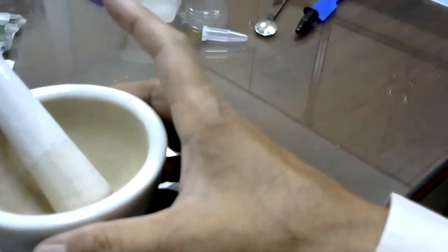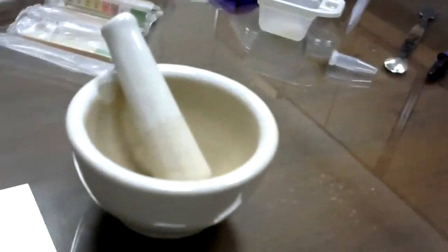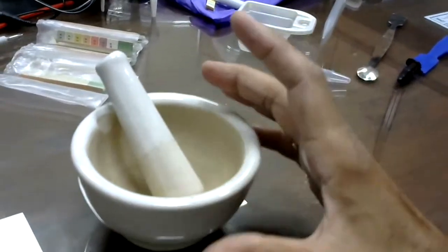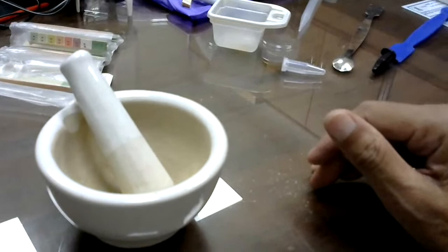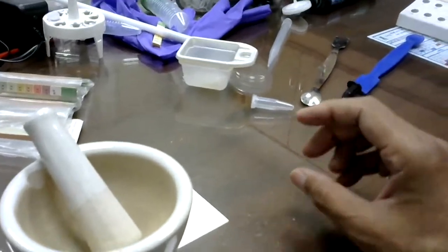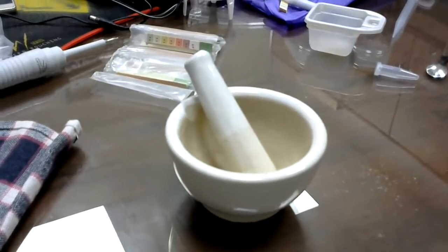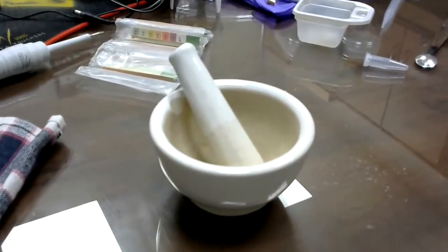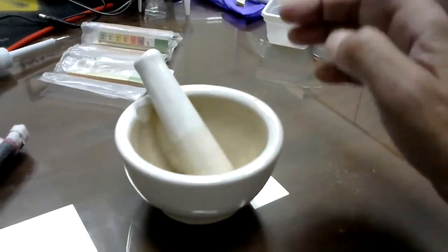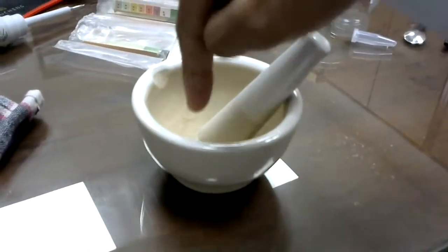Then sometimes we use liquid nitrogen for grinding. If you put liquid nitrogen here, it will be very cold, so you have to hold it with some insulating material and then do the grinding. You have to follow precautions, and whenever you are using liquid nitrogen, you have to be very careful, because the temperature of liquid nitrogen is very, very low. It is minus 196 degrees centigrade. Suppose this pestle and mortar is full of liquid nitrogen, and you put your finger inside and just twist it, it will be powder, no more your finger.